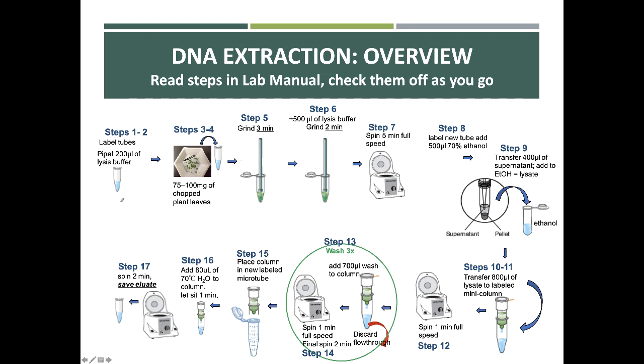Make sure you label your tubes. It seems simple, but I see it all the time where someone is working at the bench and they don't label their tubes, or they label them illegibly, and then when you go on to a later step, you don't really know what you're looking at, and then you have to restart everything.